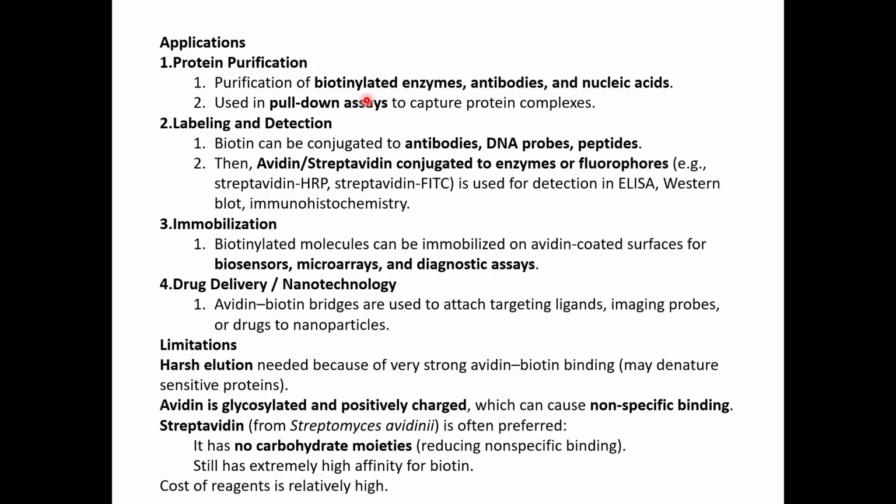And it is also used in case of pull down assays to capture the protein complexes. Then, they are also used as labels in different other detection, identification, and visualization purposes.